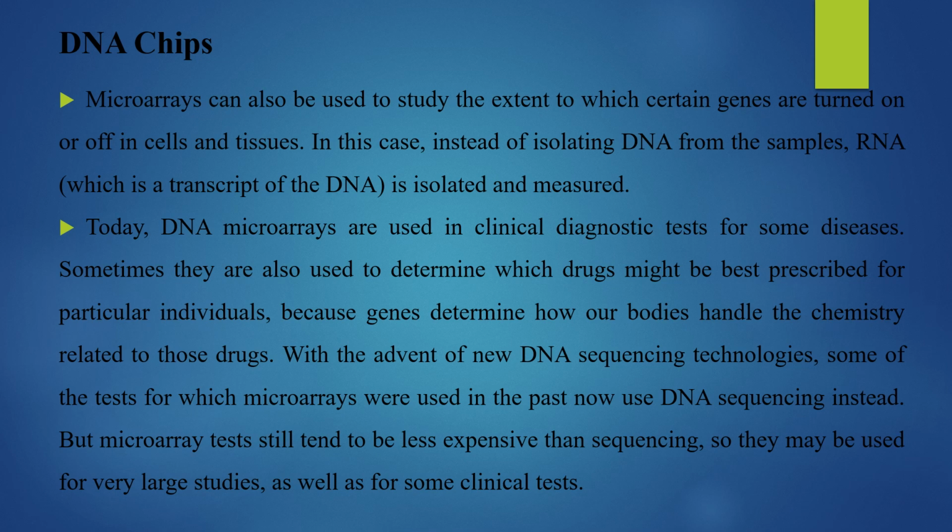So in microarrays, you have a solid phase onto which you apply your sample. If what you are looking for is available, it binds to a particular template, and then that template can be identified to let you know that what you are looking for is embedded onto your solid phase.